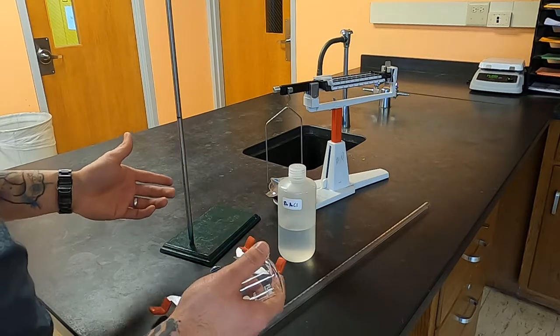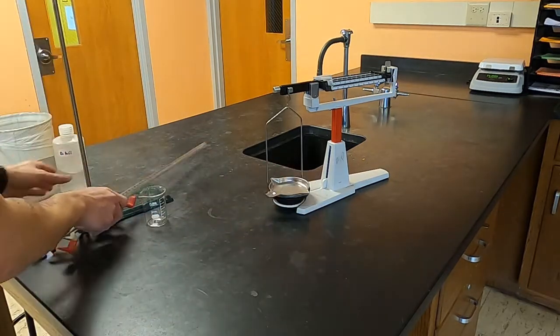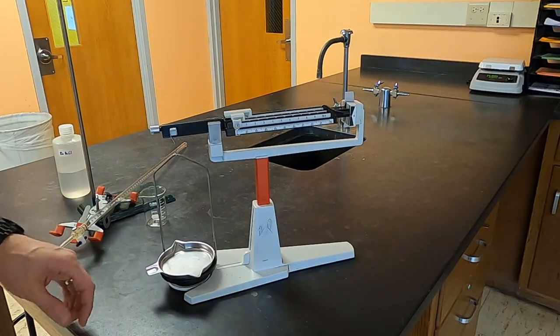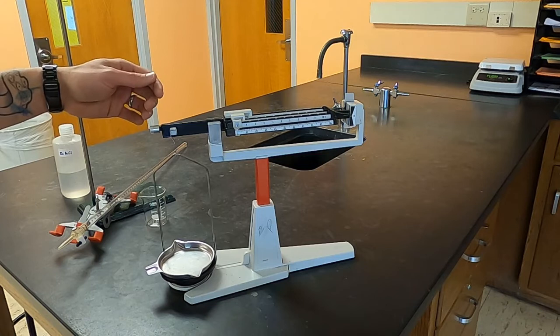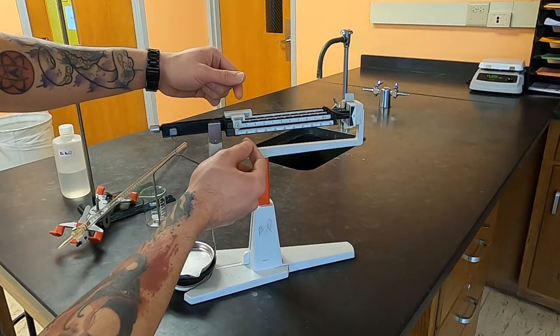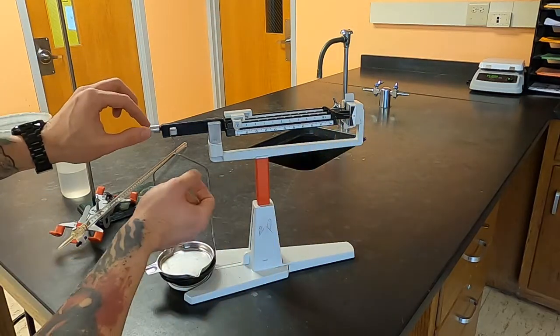The first step is going to be to take the mass of this beaker. When you're using a beam balance you want to first make sure that it is properly calibrated that it zeroes out so you push all of the sliders to zero and you look to see if the two lines match up. If not, you adjust it here.